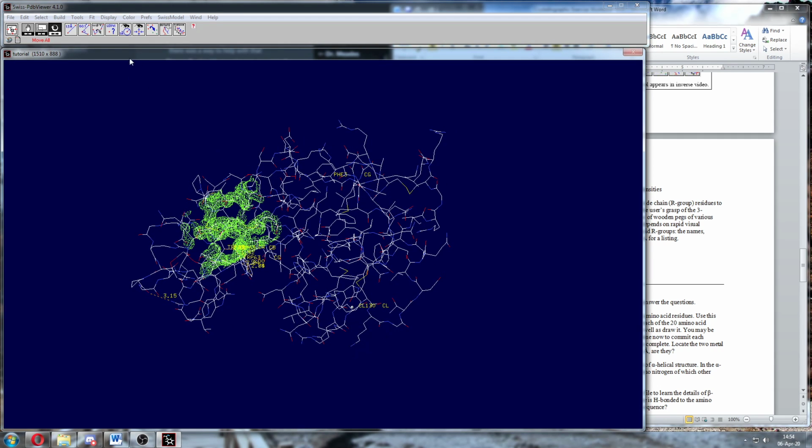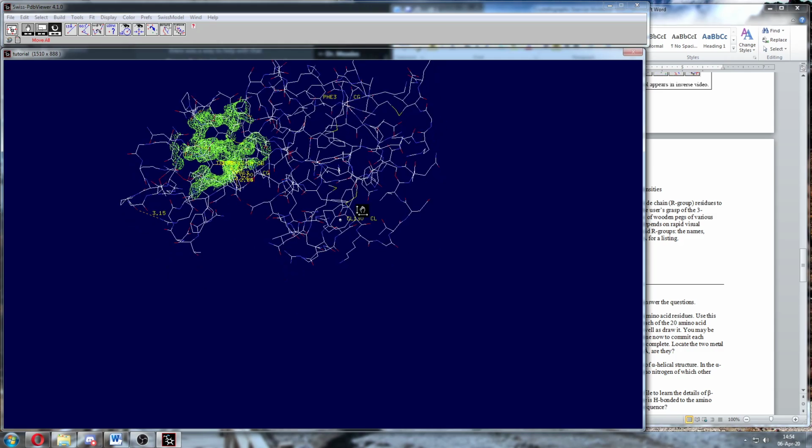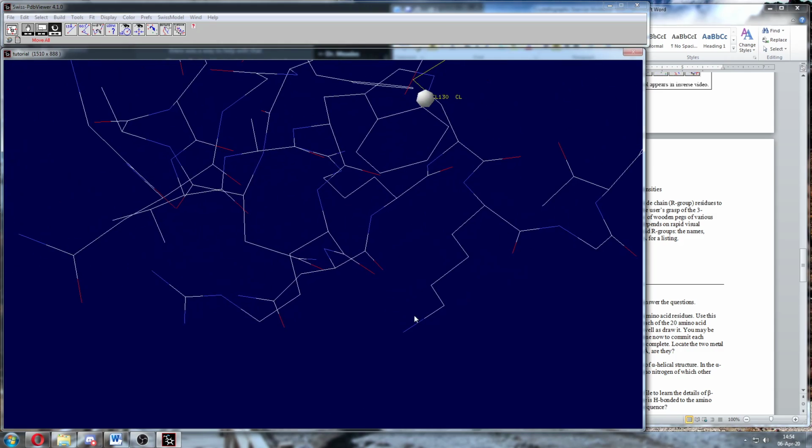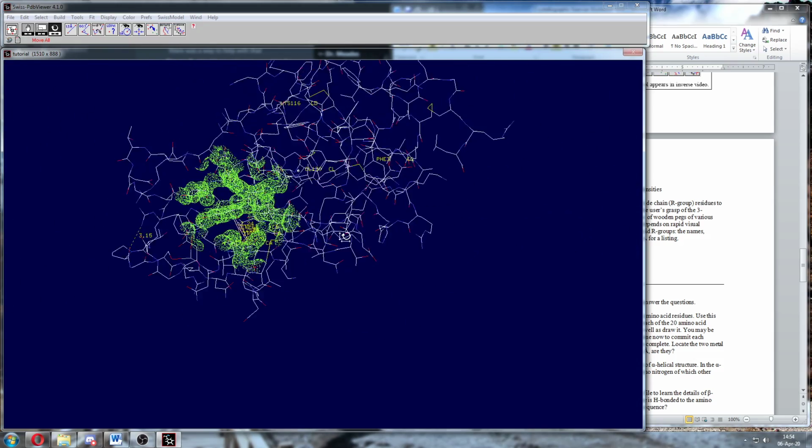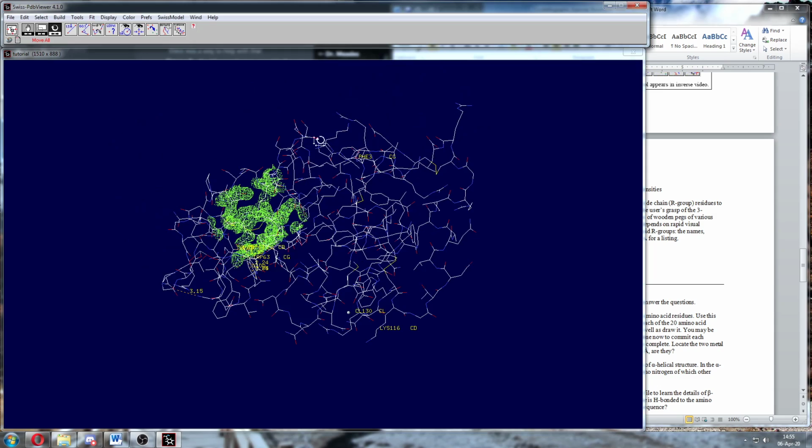There's one there. You'll get better at it the more you do it. Right? Of course, you have to know your amino acids. So here's a lysine down here. Right? How do I know? I will label it. It's definitely a lysine. Okay, so do 10 of them where you just look at the structure, right, and label what it is by guessing. And then of the 10 you haven't found yet, go back and say, which ones haven't I found? I haven't found a cysteine yet.